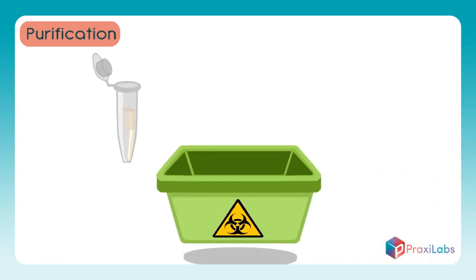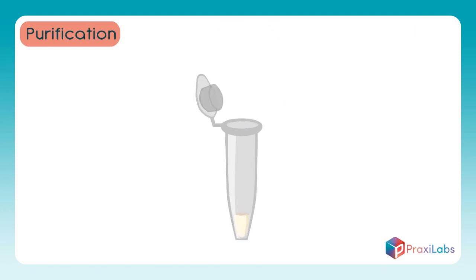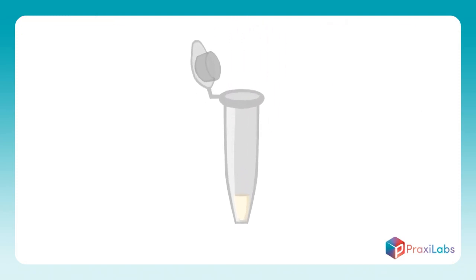Pour the liquid into the wastebasket and retrieve the remaining material using the pipette gently to preserve the sample. Dry the sample in the air. Dissolve the DNA sample in buffer solution and mix it with the sample several times using the pipette. Now you have a DNA sample ready to use in further operations.